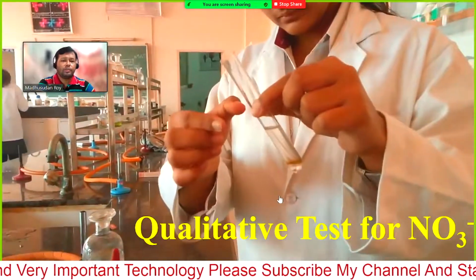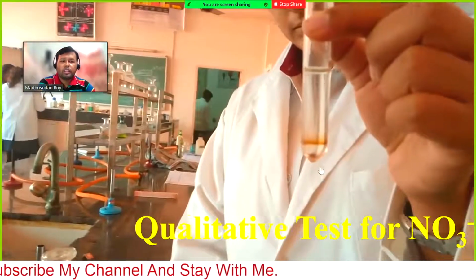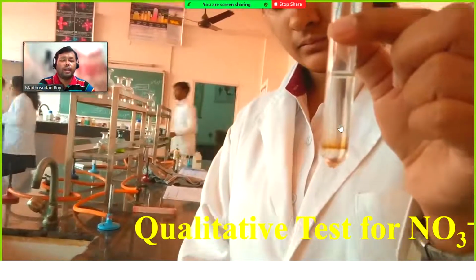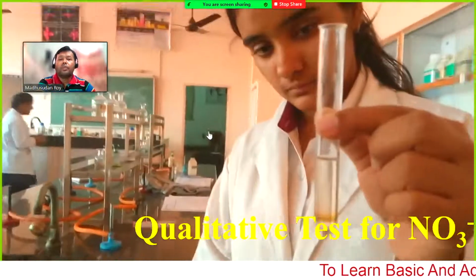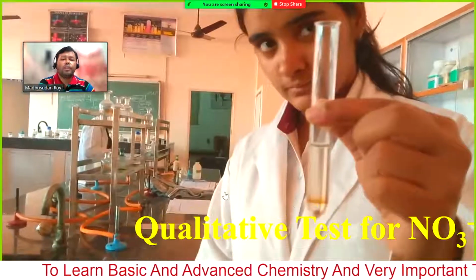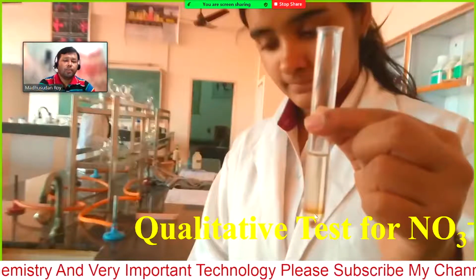That is also okay, but 2 milliliter will make the ring a little bit higher, because the bottom portion is sulfuric acid and the above portion is the rest of the solution we added previously, the original solution and our freshly prepared iron sulfate. So here you can see the brown ring of [Fe(NO)]2+. This is the brown ring.